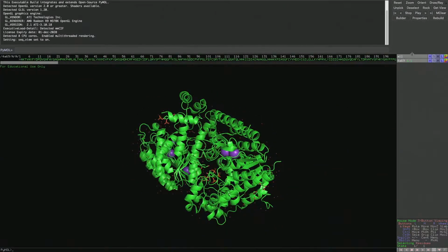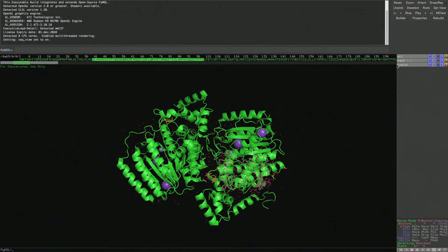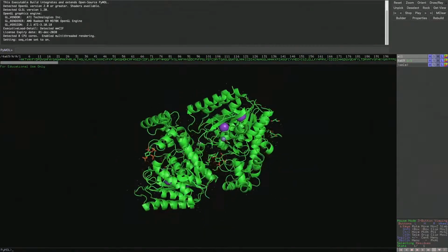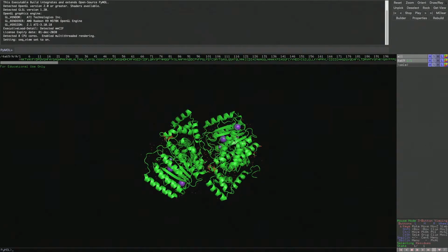Over here you have this control panel. This control panel has either objects, so like this is an object, or selections. That is a selection. This is a selection. Anything in brackets is a selection. Anything without brackets is an object. So let me demonstrate how to use the selection and objects by modifying this. This is HDAC3 Smart. There's one HDAC here with Smart here, and there's another HDAC here with Smart here. They're the same. So I'm going to get rid of one.